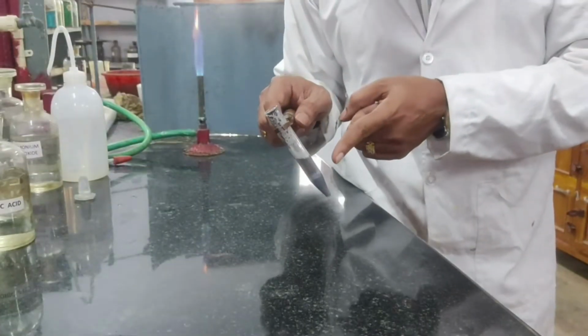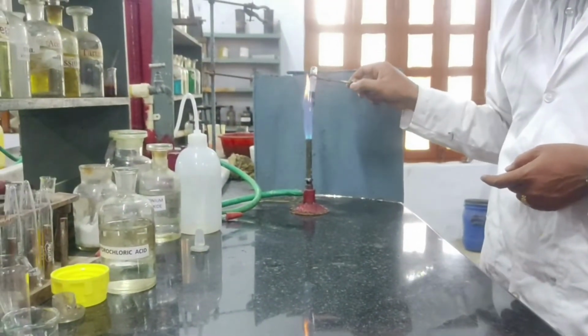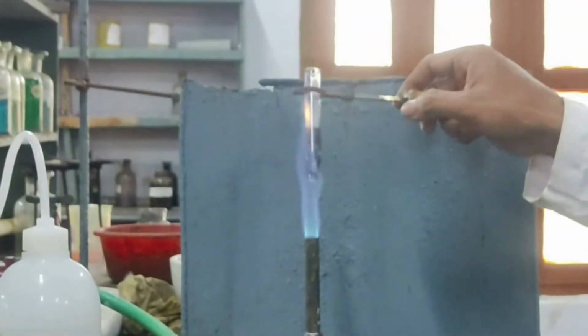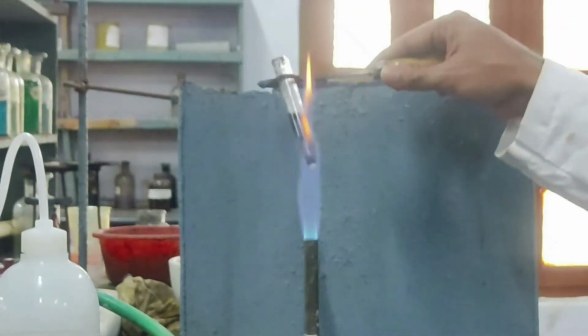After adding dilute HCl to the residue, I need to heat this mixture. I am heating. While heating, you must take utmost care, number 1, that you always project the test tube towards the sink. Number 2, don't heat continuously.